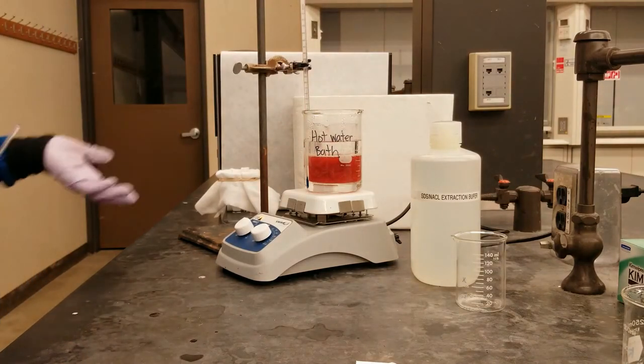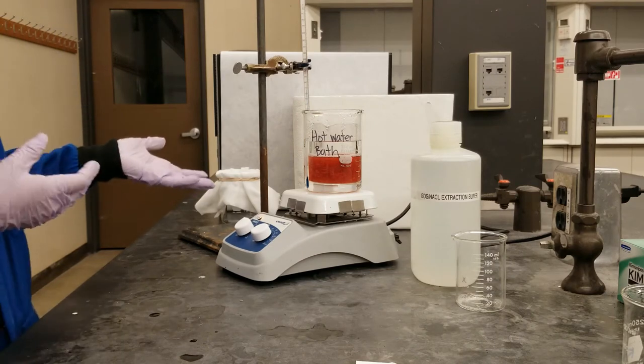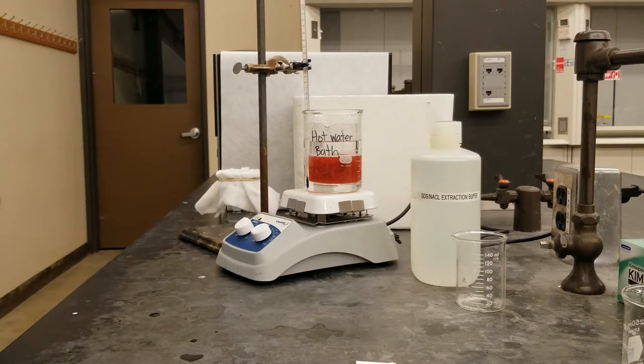We will now leave that in for about 15 minutes. Over the course of the next 15 minutes, we'll be recording the observations, and you should too.